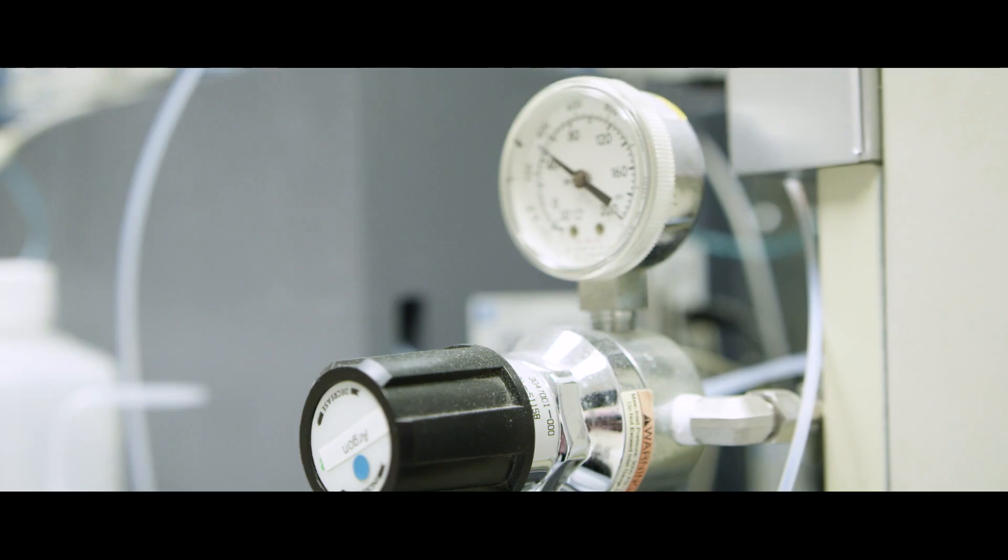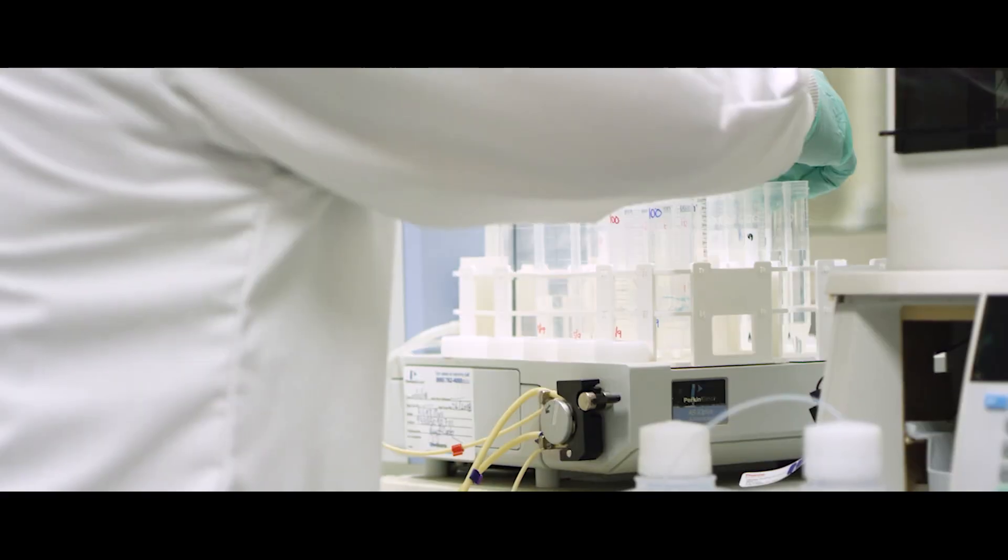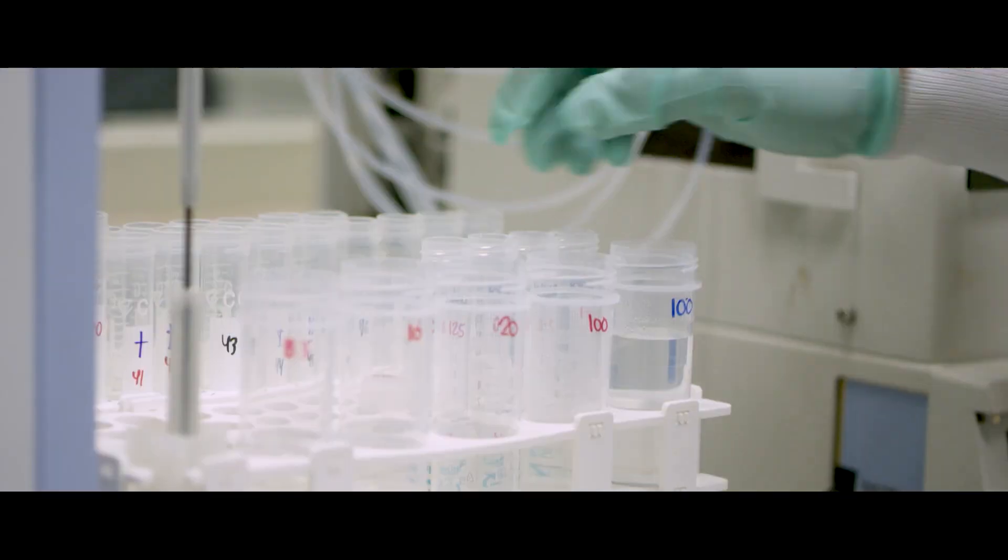State-of-the-art instrumentation is used in the laboratory. Iron chromatography is used to analyze for salts and minerals, and inductively coupled plasma mass spectrometry is used to analyze for metals.